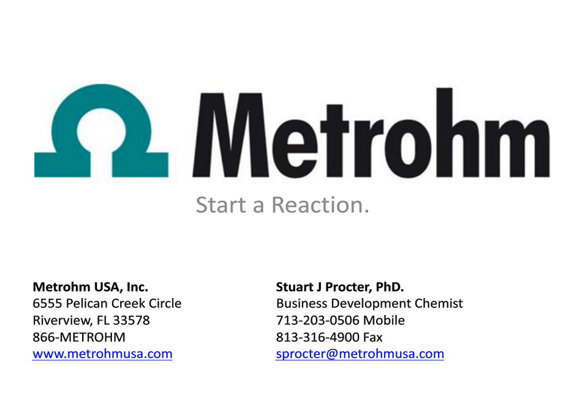Not so much clinical, but more biological, where, again, I don't want to just do a dilute and shoot, but I want to do some type of, as I like to call it, a rough and ready cleanup. And so we're starting to see it in that area too.